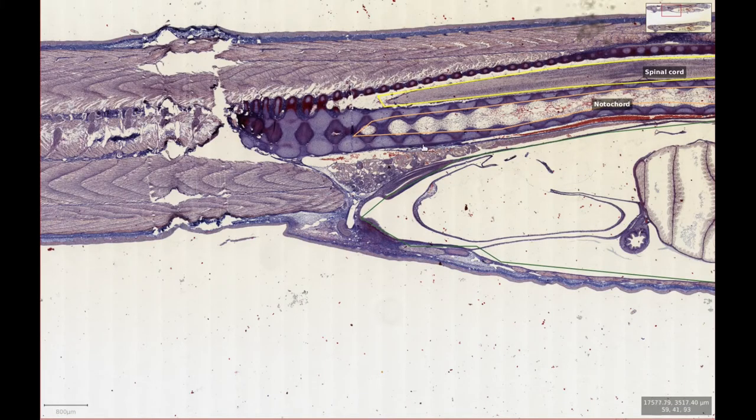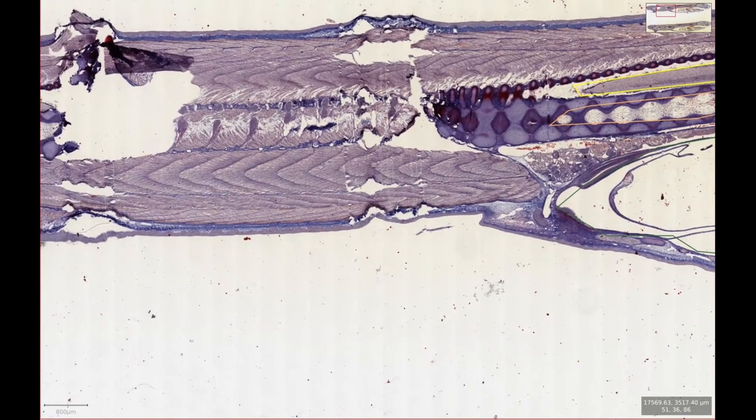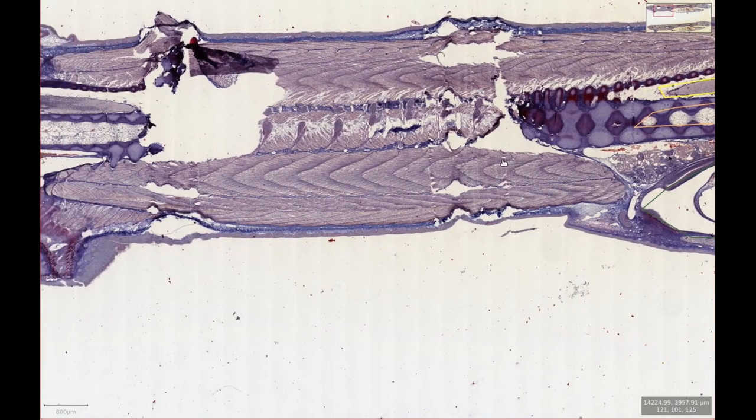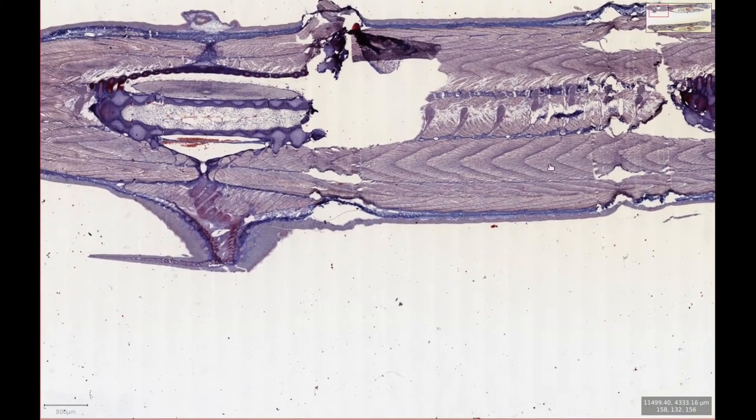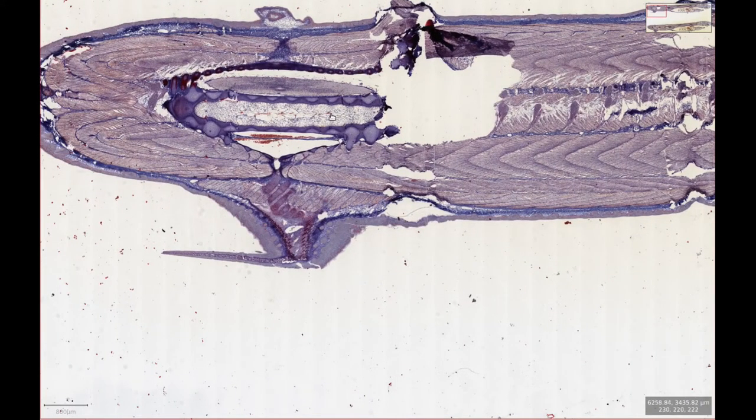Behind the coelomic cavity we have chevrons of striated muscle tissue forming the tail, with another small section of spinal cord enclosed by vertebra and with the notochord below.